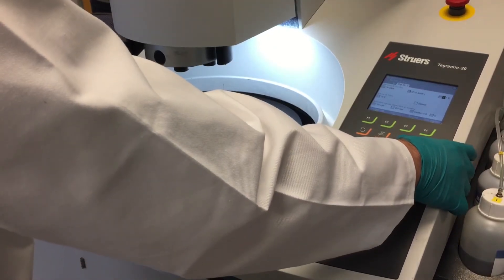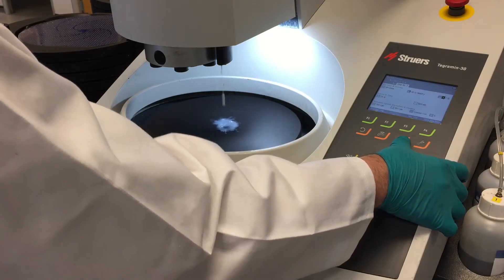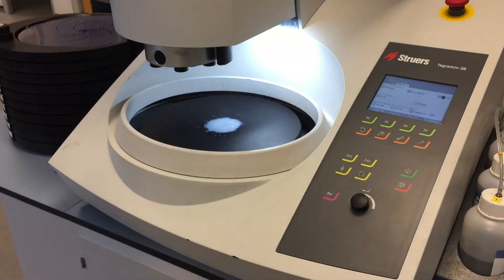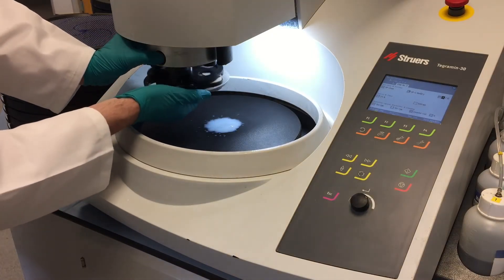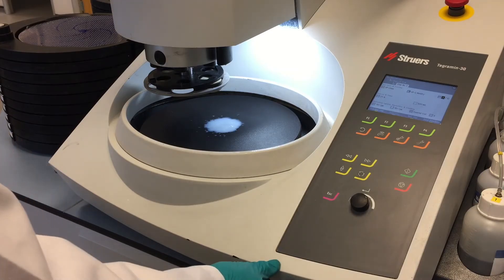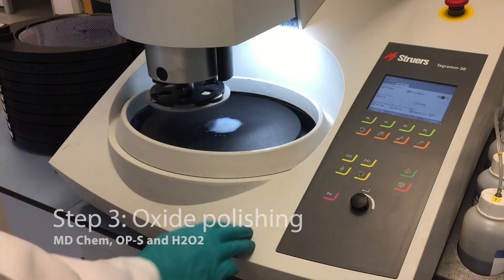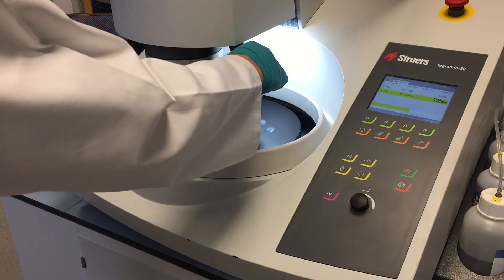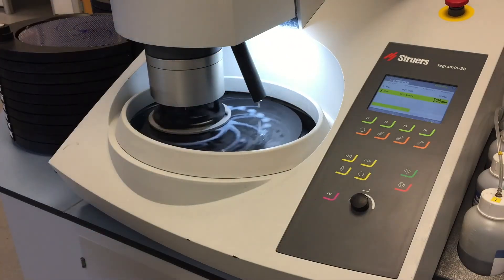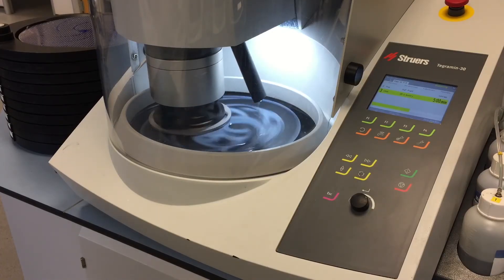Matt's going to pre-dose the machine with a little bit of OP-S, get the cloth nice and ready to go. Now we're going to load up and away we go for the final step, which is OP-S running for 5 minutes. We also have hydrogen peroxide in this mix, which is excellent for chemically cleaning the surface of the sample. The important thing here is that we are going counter-rotative on the disc, which ensures we keep as much of the OP-S on the cloth as possible and don't let it spin off, giving a really good finish.